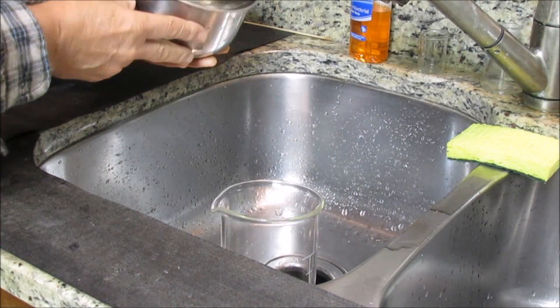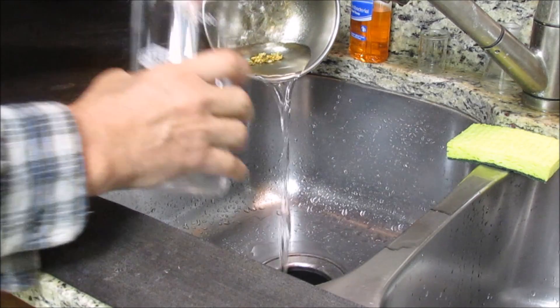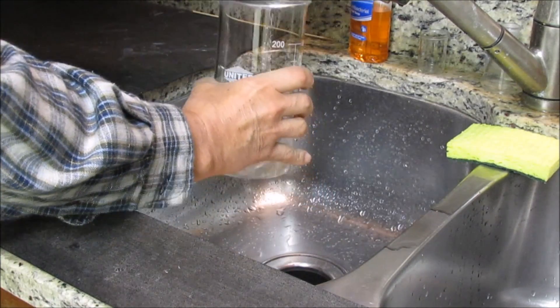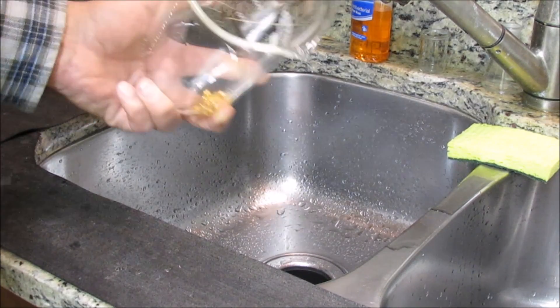Now I'll dump out the tap water and add the gold flakes to the beaker here. There's no need to rinse that gold with distilled water because I'll be turning it into a chloride when I dissolve it in aqua regia.